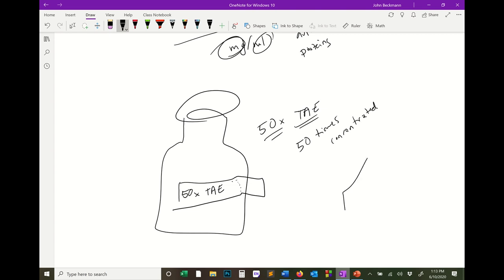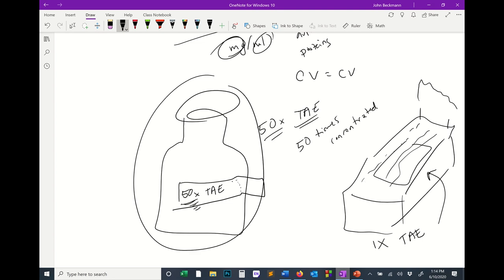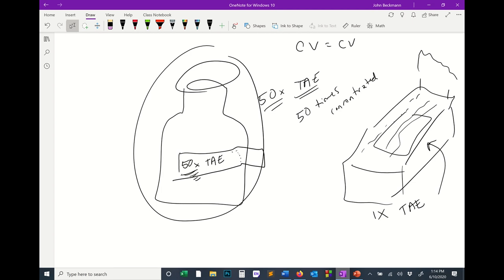So when we run a little agarose gel with our electrodes, when we do our electrophoresis, okay? The buffer that goes in there is 1x TAE. Okay, so that means what we would do is we would use the CV equals CV formula. We would come to the stock solution of 50x TAE, which is 50 times concentrated, and we would say, how much of 50x concentrated volume, how much will we need to make 1x?